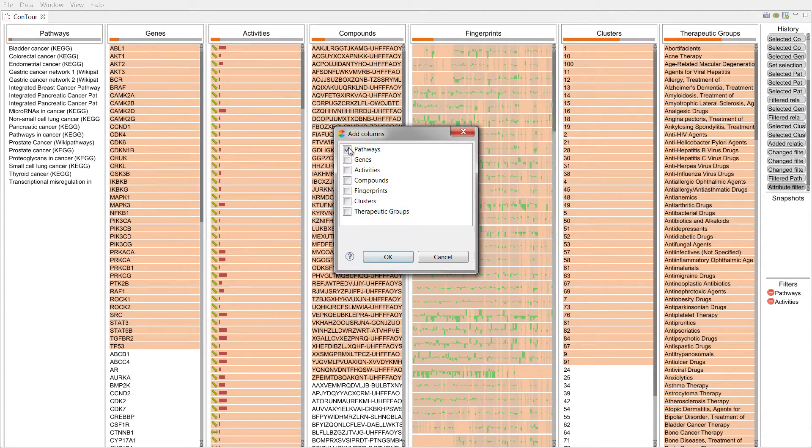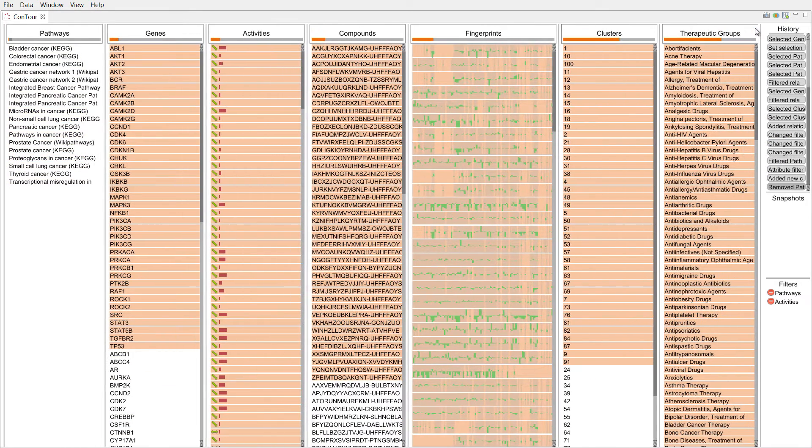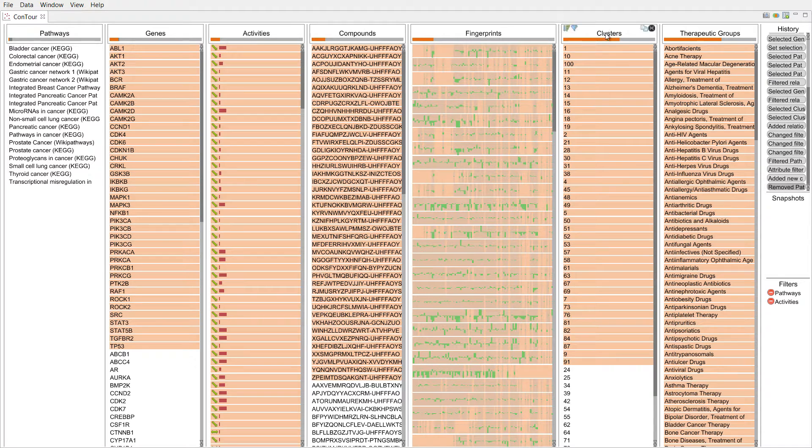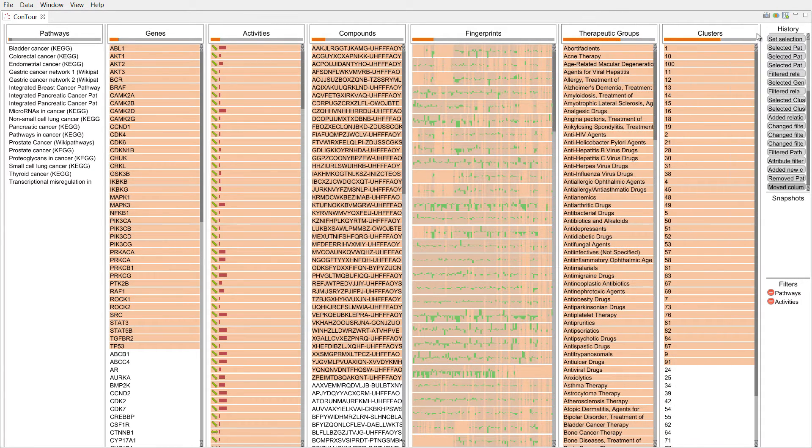Columns can be flexibly added, removed, reordered, and duplicated.